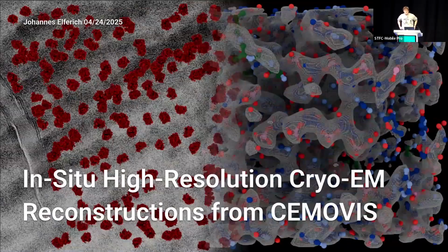So thanks, everybody. I want to thank the organizers for inviting me. And today I'm very excited to talk about a project where we try to figure out whether an alternative way of getting thin slices of cells would work maybe better or equally well as FIB-milling, which is the predominant technique that we use nowadays to make these fantastic images.